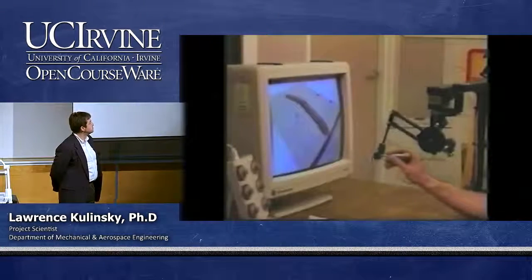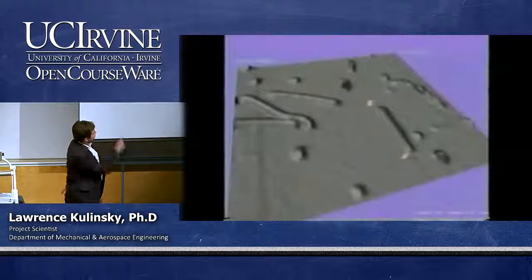When we wrote IBM with xenon atoms, we did it with actually quite a few motivations. The primary one was scientific. It was to demonstrate that we really had control of atoms at the atomic scale and that we could position atoms in a way that's very similar to how a child would build something with Lego blocks. You take the individual blocks, put them where you want them to go. And then we had to demonstrate that we could do this over and over again with atomic level precision. So putting the atoms into a regular pattern was one way to do that. That worked out very well. Understanding the properties, movement, and interaction of various materials at the nanoscale.